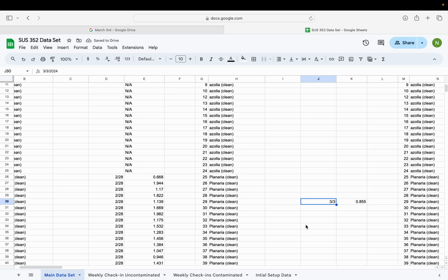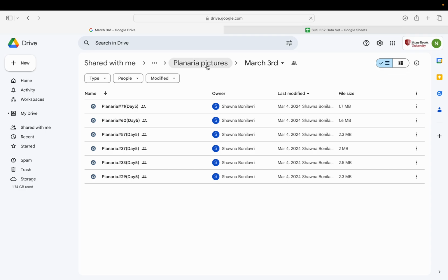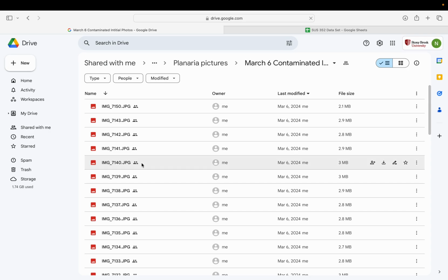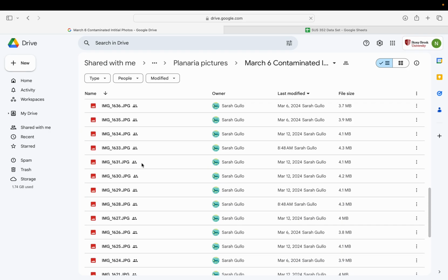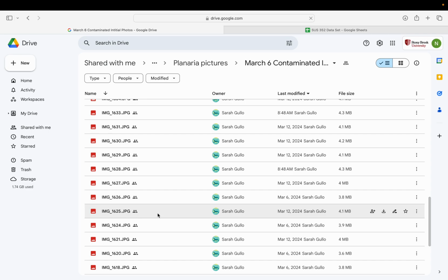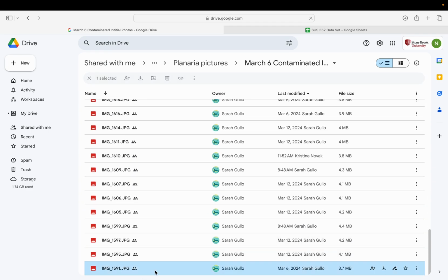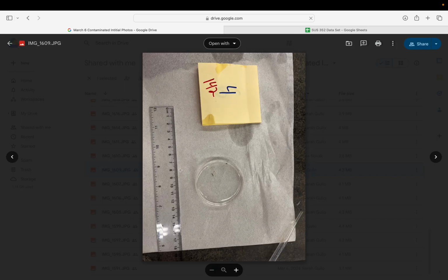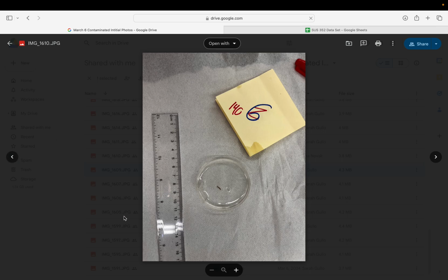So just to show one other photo, maybe that's a little easier to do for this set, for the side of it here. I know this is the update one, but March 6th is a great example. I'm just going to scroll down and choose a random one here. I just choose the bottom one. Here, let's see. 32, okay, not a good choice. 142. Yeah, let's do 140. That's a great option. So this is going to be 140.